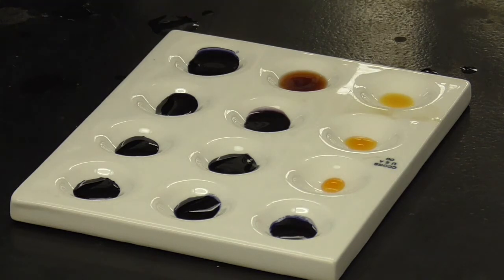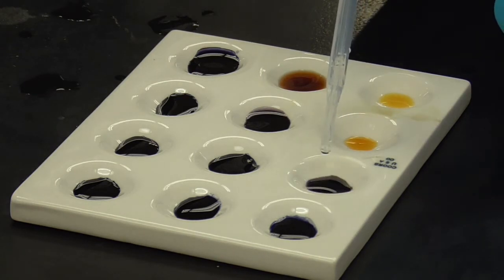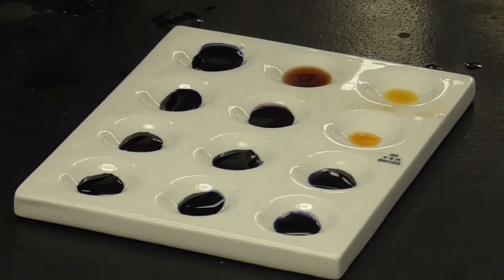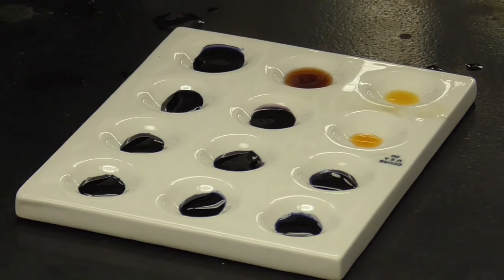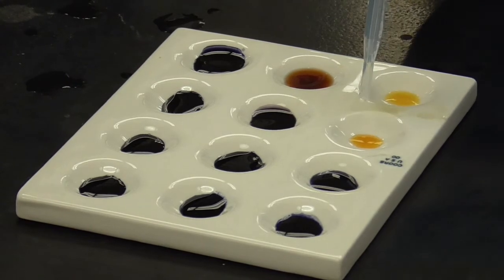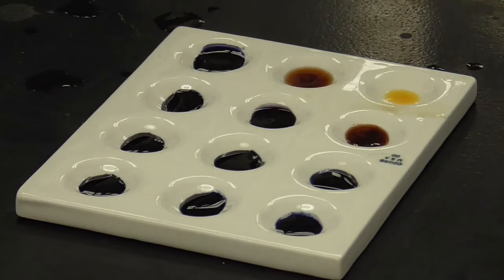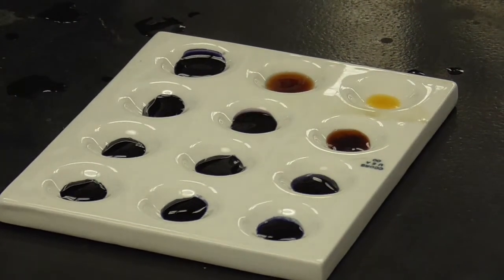Tube 2, where we just put 2 drops of the enzyme. Let's see what that one's looking like now. 1, 2, 3, 4. Still pretty dark. We had a little bit of enzyme in there, but not enough yet to see the difference in the starch. The third tube, this is the one where there was 4 drops of the enzyme. 1, 2, 3, 4. Now here we definitely see the evidence that the enzymes have been working on the starch.